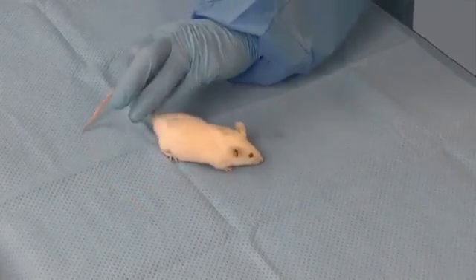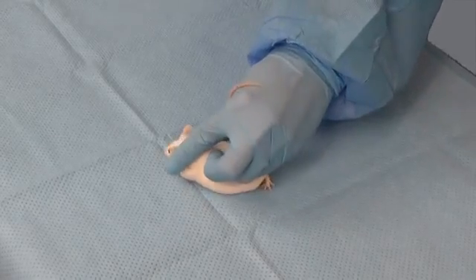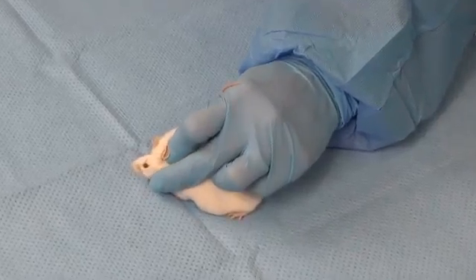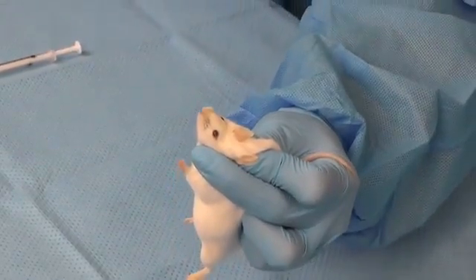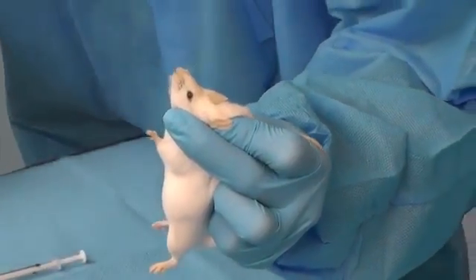This is the same restraint technique from another angle, demonstrating how the middle finger is used to stabilize the mouse's neck and head. The mouse should appear as comfortable and relaxed as possible, as measured by respiratory rate and effort that are within normal limits.